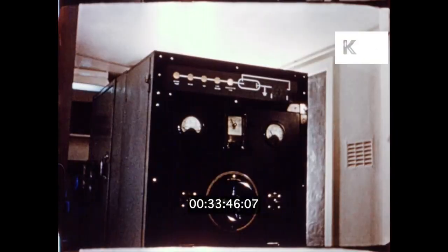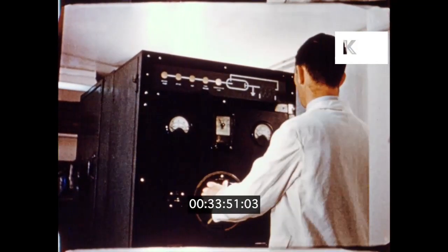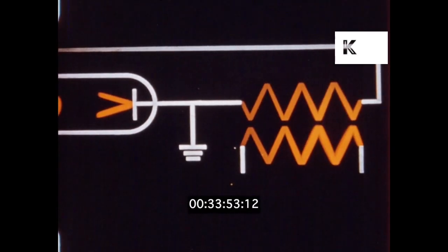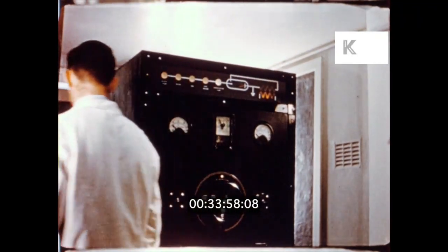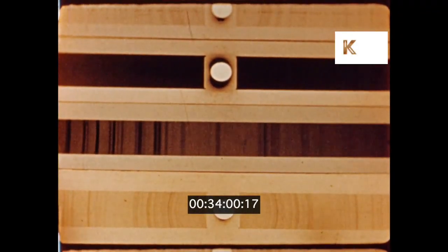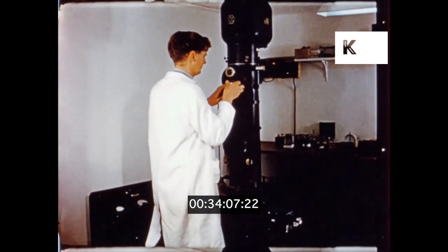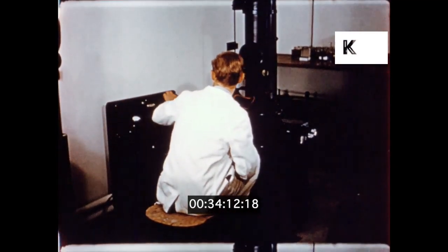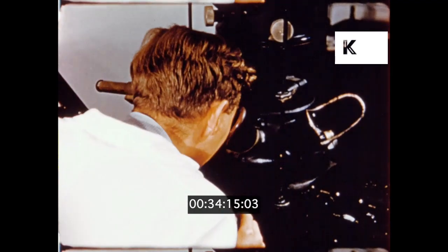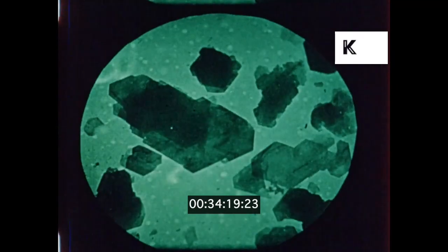Just as precise an examination is required by the paper makers. They too use vast quantities of high-grade clay. The X-ray plant gives a positive indication of clay by producing a strip negative, where the characteristics of a sample are clearly shown so that the consistency of the product is maintained. The electron microscope is another useful tool of the research department. By direct observation, enlargements of 40,000 diameters can be seen or photographed, each particle of clay blown up to the size of a geologist's specimen.